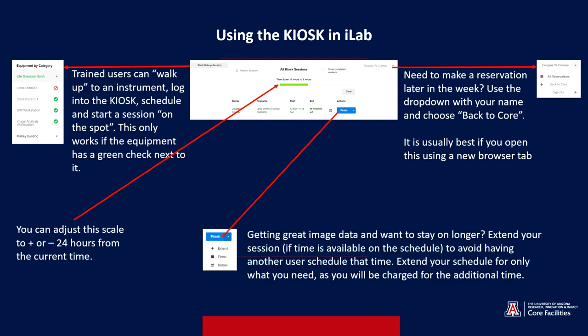Say you signed up for an hour's worth of time on a microscope and you realize you're getting great images and you want to keep going. You can come back to the kiosk and extend your session, either in this window or the other one that comes with the kiosk. Just be realistic and reasonable in how you extend your session, because if you add more time to it, you will end up being billed for that time.